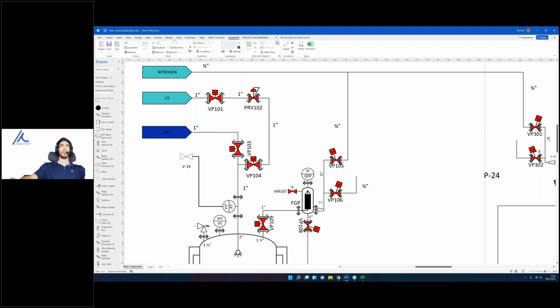So it was everything closed. Then we opened these 3 valves. Then we closed them and opened this one. And then to the next one, we close this one and open these 2. So as you saw, in just a few seconds, we have created the phases with all the information being automatically recycled rather than drawing everything again from scratch.